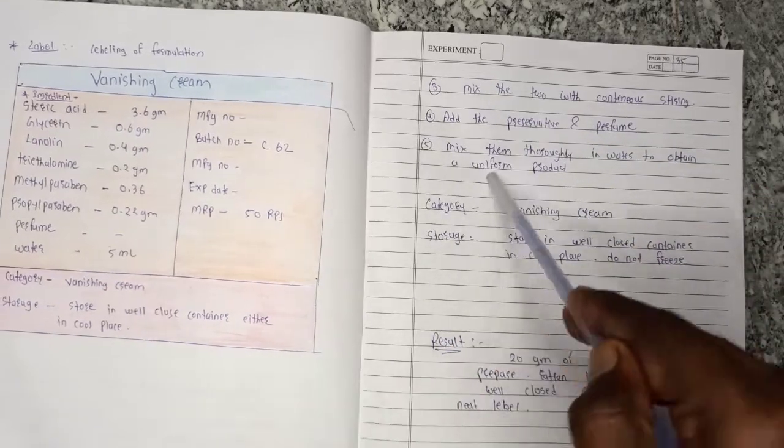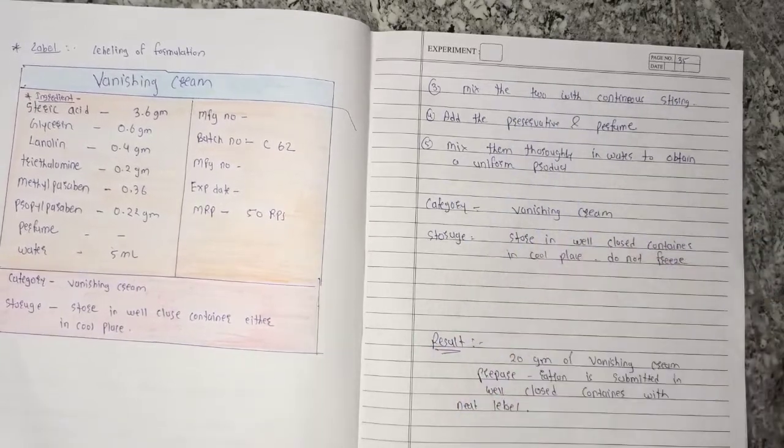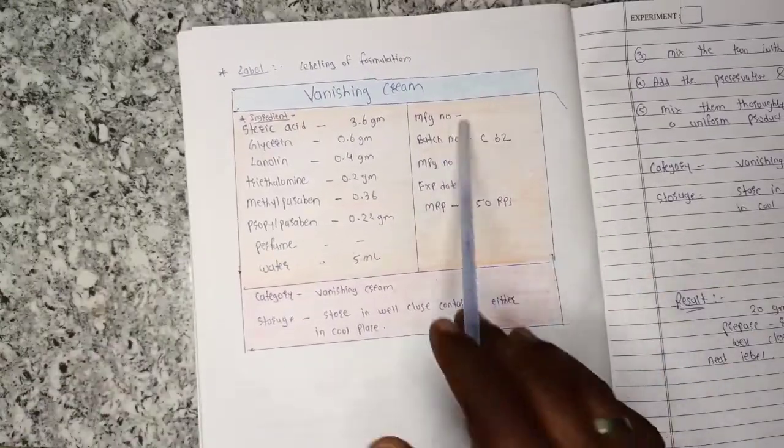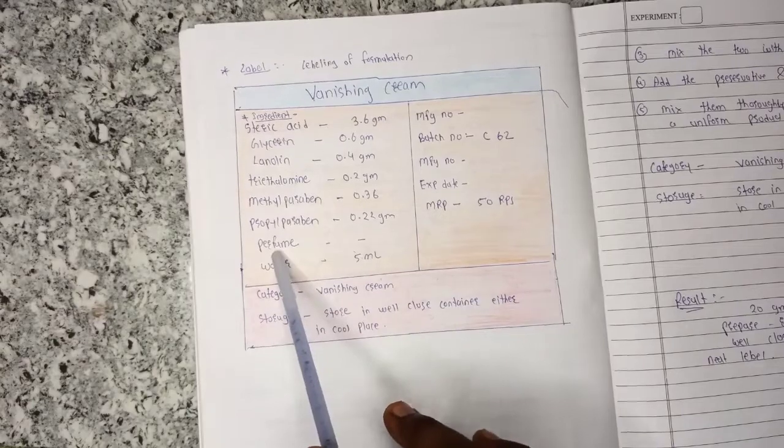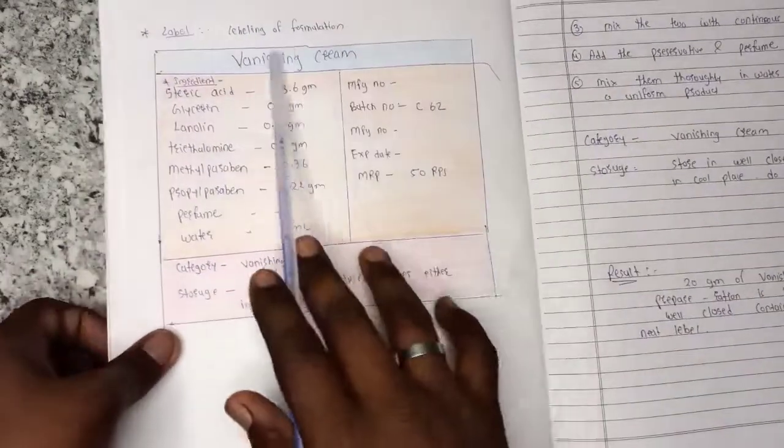After that, add water and stir until the preparation is ready. Then you will need a label. Add the ingredients to the label, along with category, storage condition, and heading.